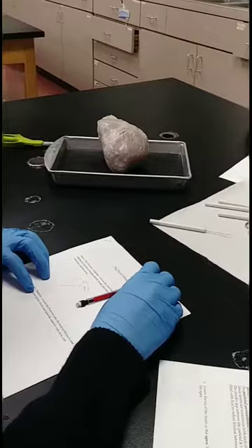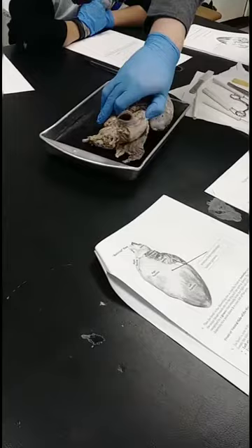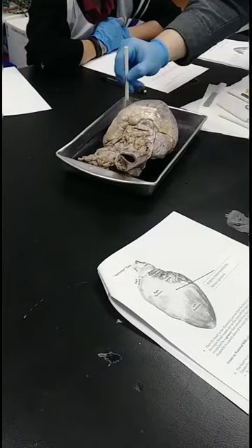Okay. Open up your scalpel. This right here. Now you're going to use your probes. So open it up and find the pulmonary vein and pulmonary artery. So let me get my second glove on. Okay, that's what these are for. So these are your probes, right? You also have some pins. You have your scalpel.